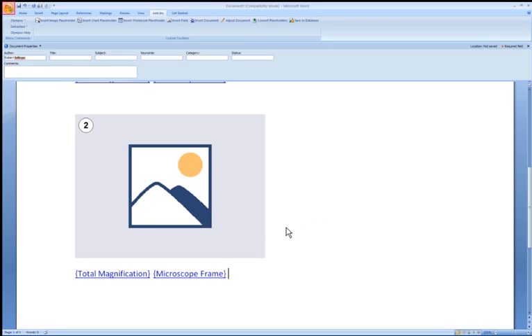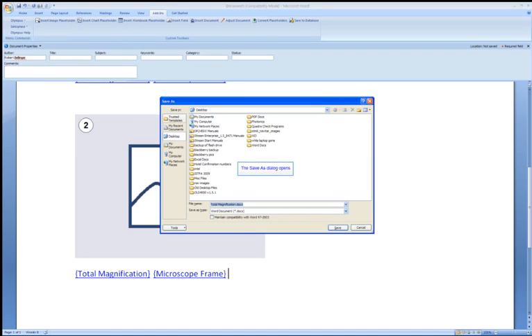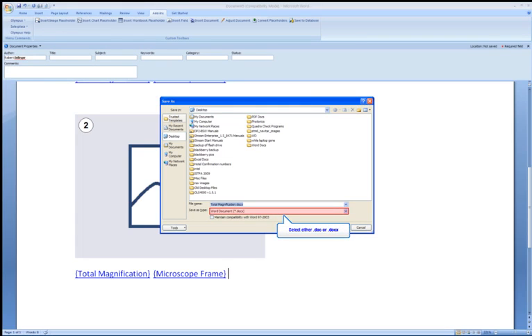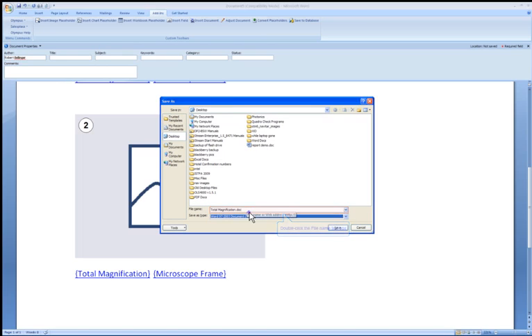We now need to save this document. The file type needs to be a .doc or .docx file so Stream can access it. Provide a name that describes the type of page template you have created.